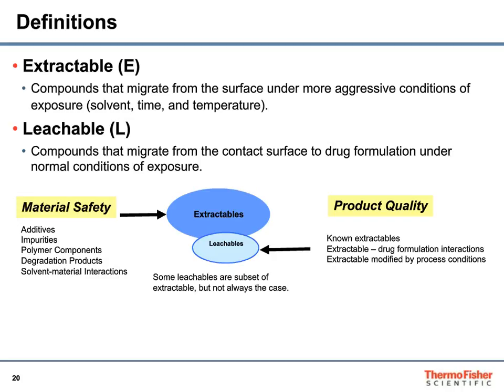In general, the extractable is more about the material safety. Extractables are mostly the additives, impurities, polymer components, and some of the degradants.